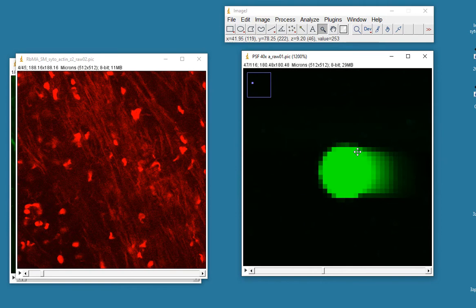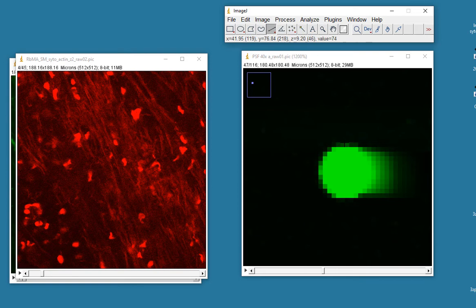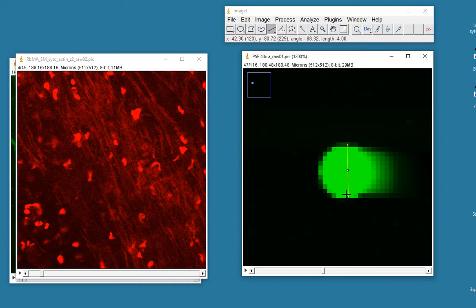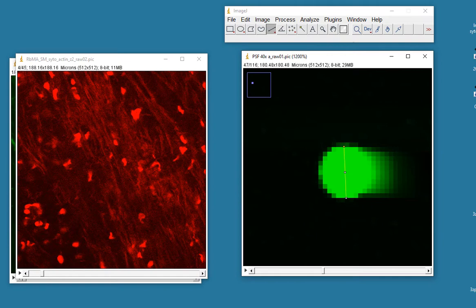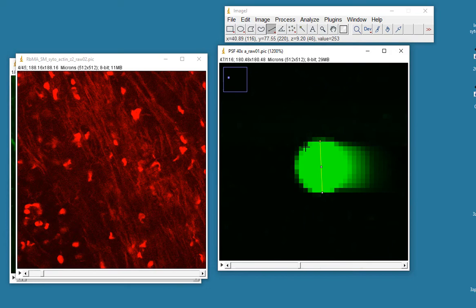But if we were to measure these beads, you can see there's a bit of flair here. If I wanted to measure the diameter of that bead I'd maybe make it this sort of size. If you see up here when I draw this line, it's coming out at 3.9, let's call it 4 microns. This is a rather large bead, we would use much smaller beads for this kind of work to determine the point spread function, but this will serve a purpose.